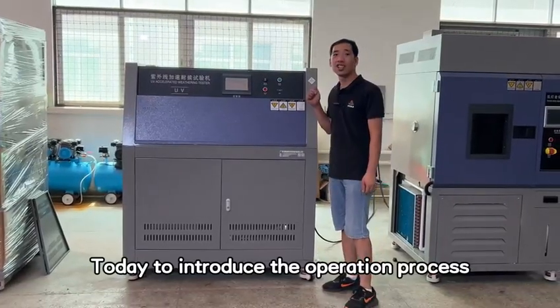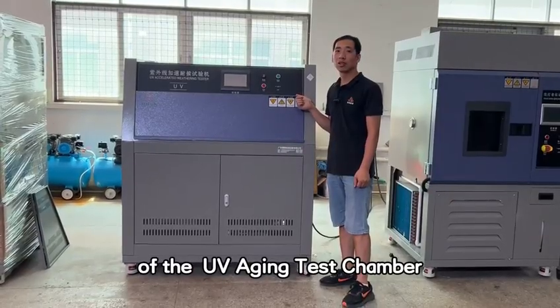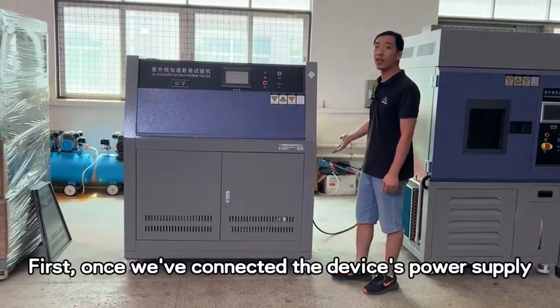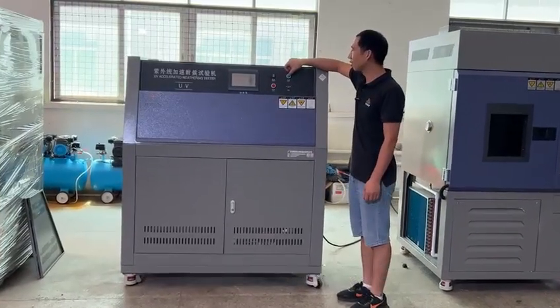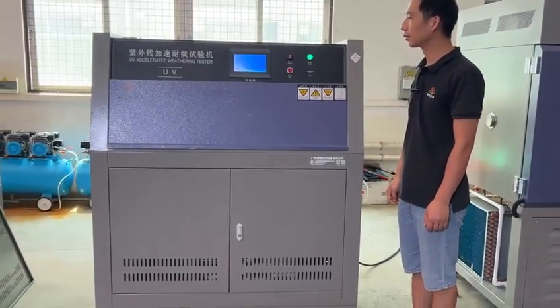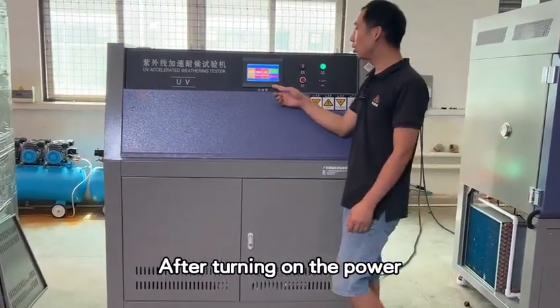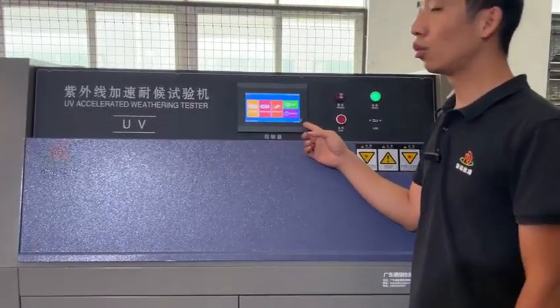Today I'll introduce the operation process of the UV aging test chamber. First, once we've connected the device's power supply, we'll turn on our power button. After turning on the power, this is the main interface of our device monitor.